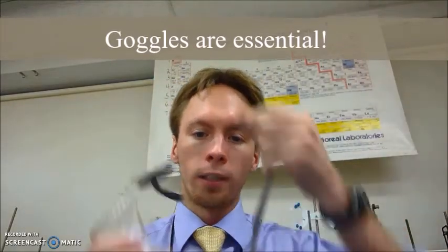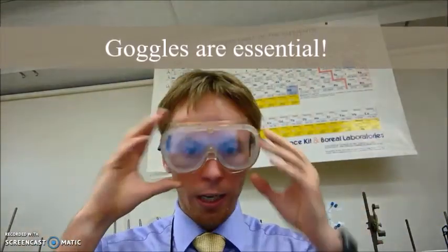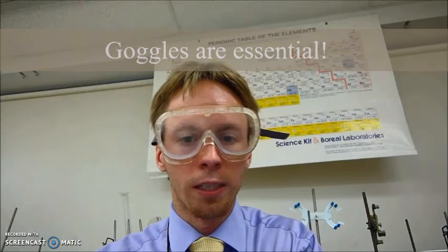For this lab, we won't be working with any dangerous chemicals. We're just dealing with ice and water again. So there aren't any SDS to read for this lab. We are going to be working with heat and glassware, though, so we're going to need to wear our goggles. As always, whenever we're working with heat, glassware, chemicals, our goggles are essential.